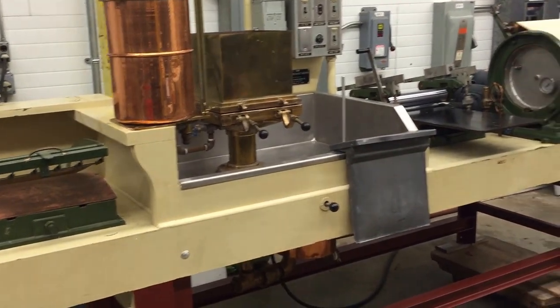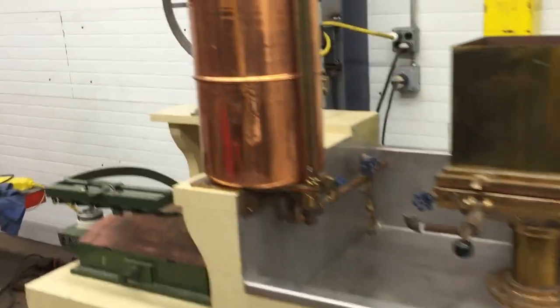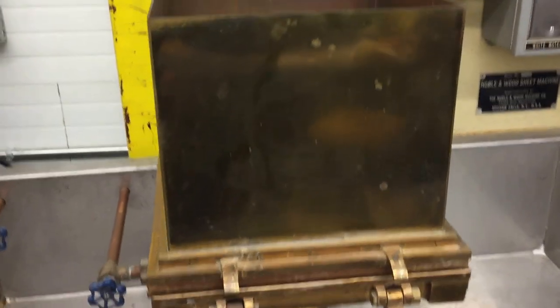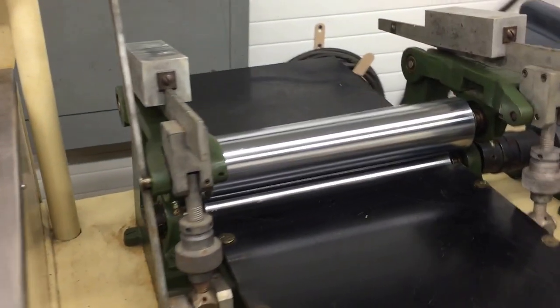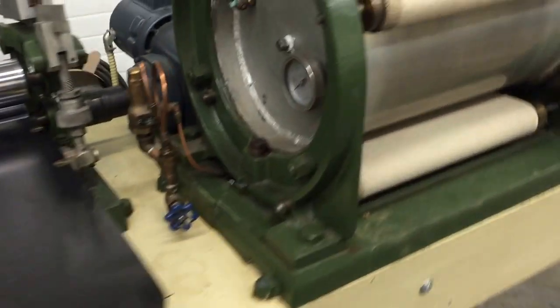The main apparatus that make up the machine are: the proportional assembly with this copper drum here, the sheet mold press assembly, the press, the hot plate, and the rotating drying assembly.